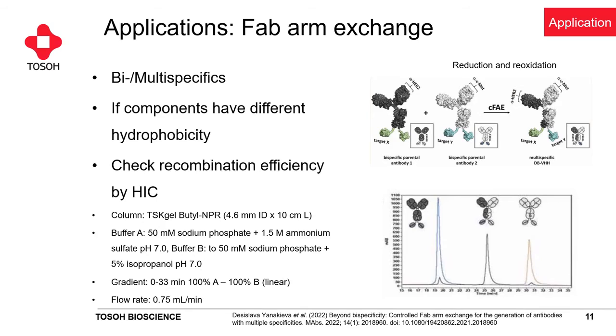I promised in the very beginning that HIC is actually a very versatile method, and as we were just looking at the very small modifications that can even be detected with hydrophobic interaction chromatography, there are also bigger changes that can be looked at when using hydrophobic interaction chromatography.